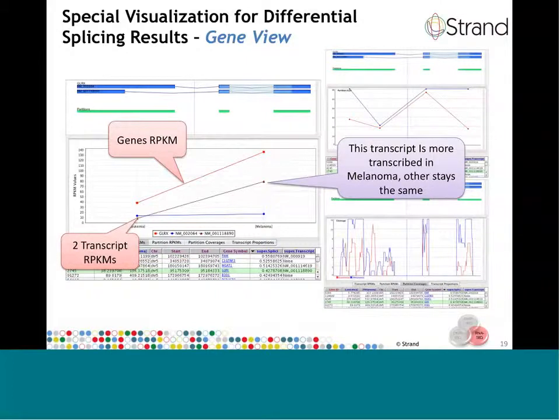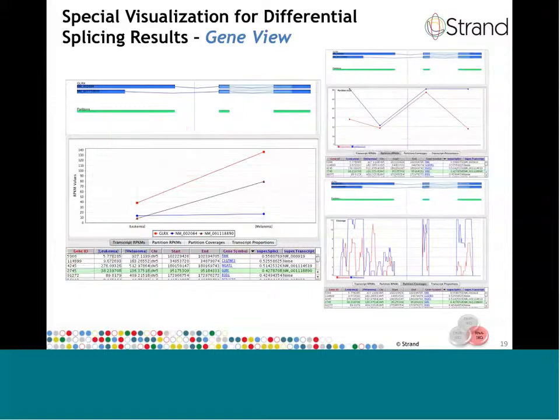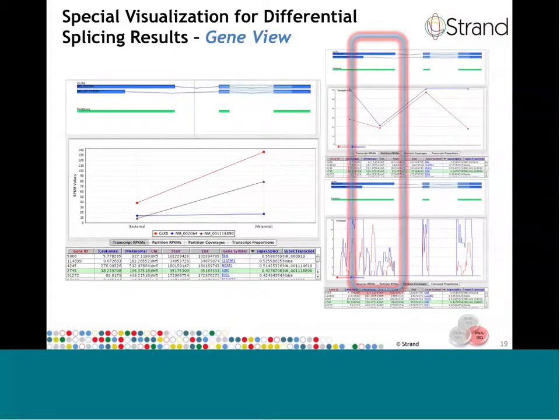So the evidence we have for the differential splicing is captured on the right side of the slide in the partition RPKM and the partition coverage plot. The partition coverage plot shows the coverage for the partitions, with the coverage for the leukemia sample shown in red, while the coverage for the melanoma samples is shown in blue. The 2 transcripts only differ in the length of the first exon, seen from the left.